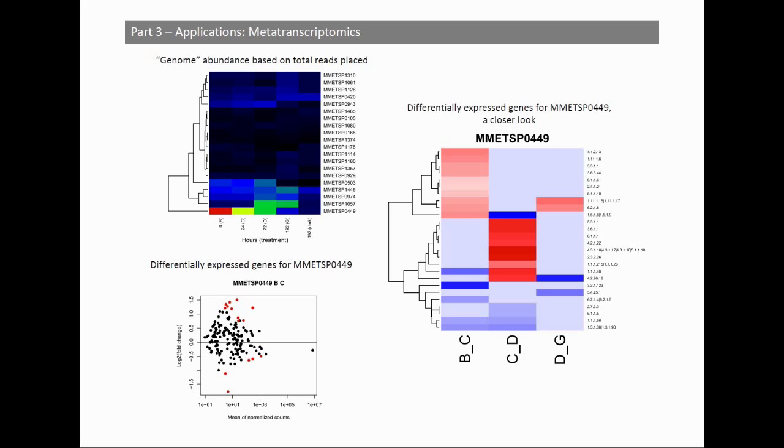This has been looking across all possible transition points in the time series that defines this experiment for this genome. And these are the different enzymes that are significantly differentially expressed. Red indicates upregulation, blue indicates downregulation. Now we can start to pull apart the ecological story that's underlying this differential expression. And these are enzyme commission numbers for the different coding sequences that we are evaluating.